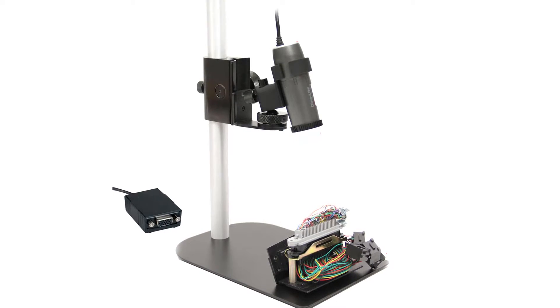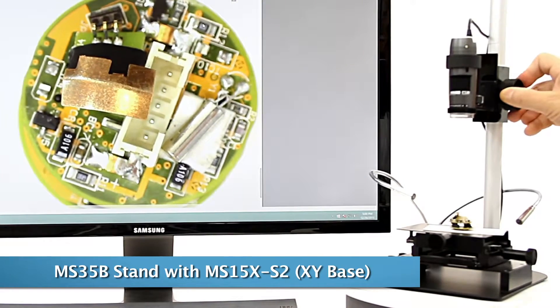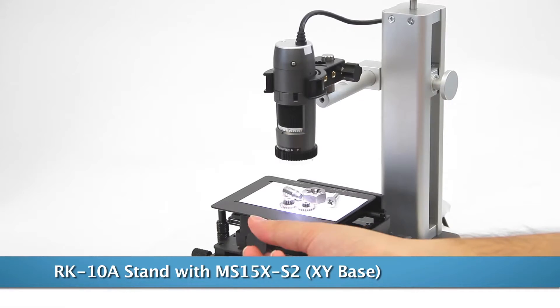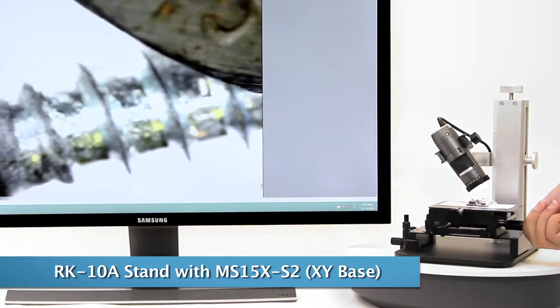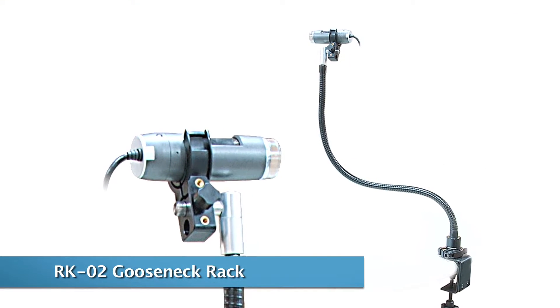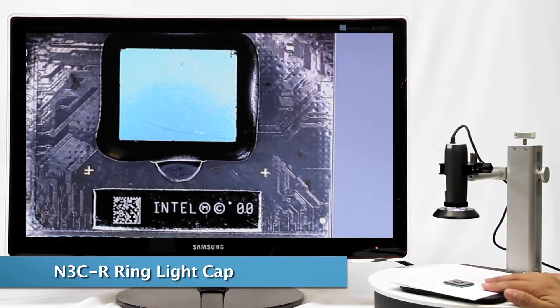There are many compatible and recommended accessories, including the MS35B, MS36B, and RK10A tabletop stands with various features, all including a fine adjustment knob for precise viewing. For further precision, the XY base helps adjust the positioning of viewing subjects. The N3CR front cap helps evenly illuminate objects.